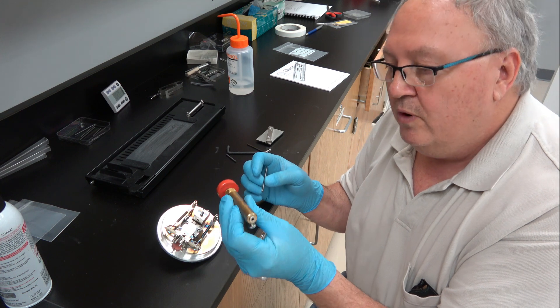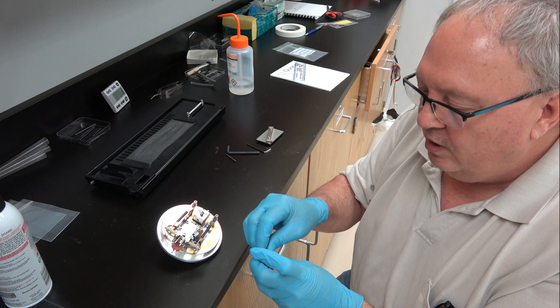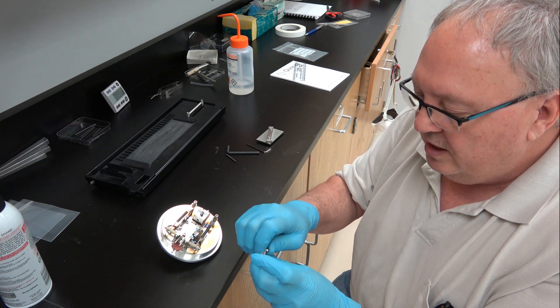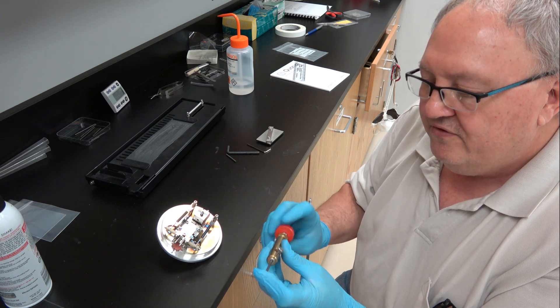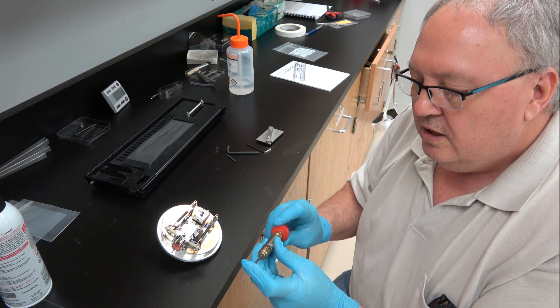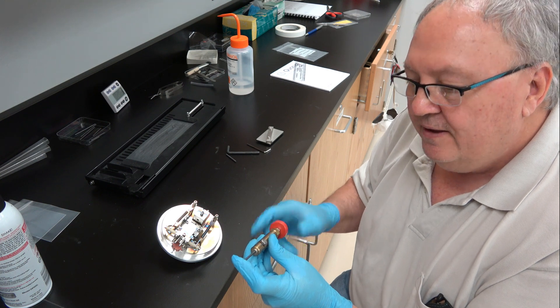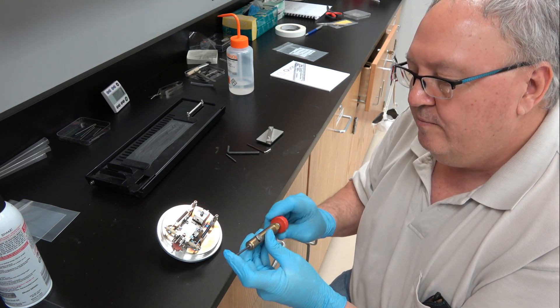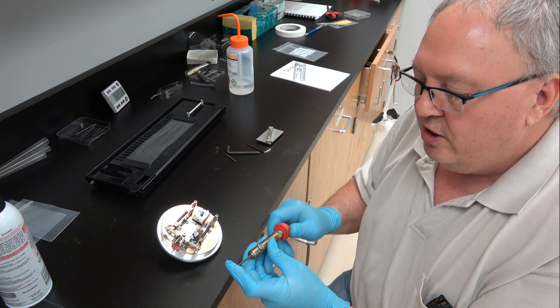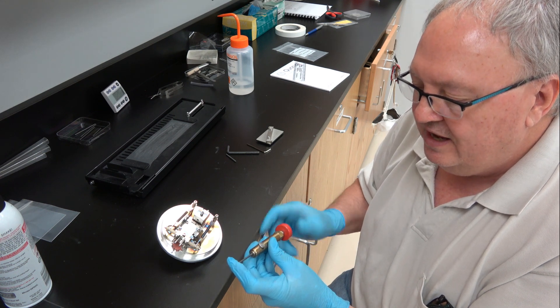You're going to use one of these carbon rod shapers which came with your machine. There's a blue one and a red one. The red one is preferred — it gives you a thinner, smaller diameter tip of 1.4 millimeters in diameter.